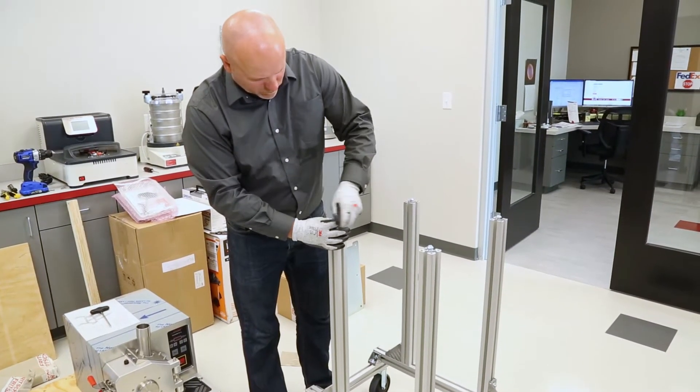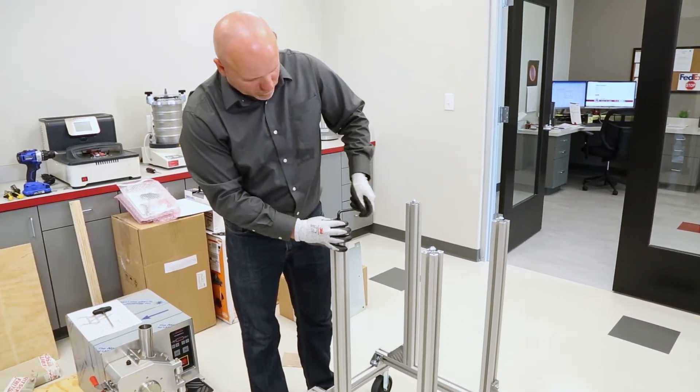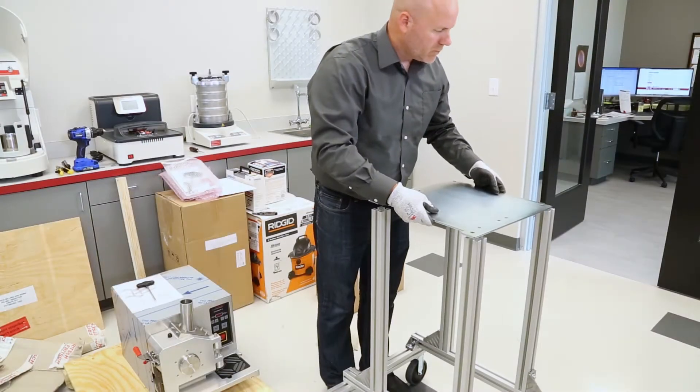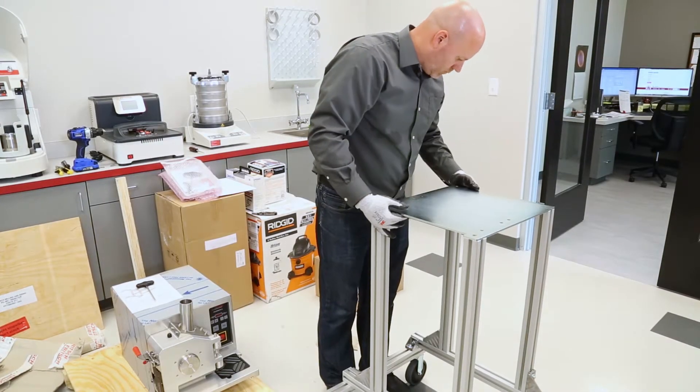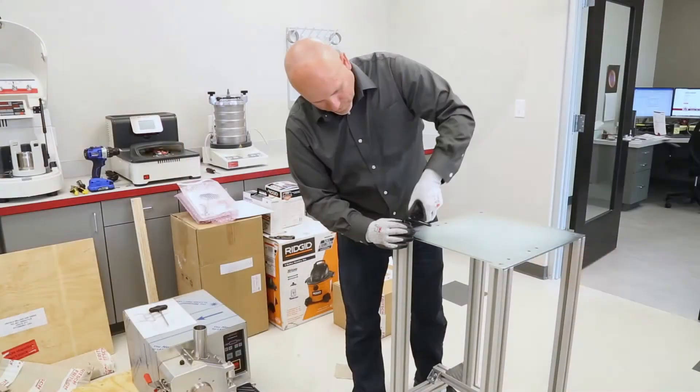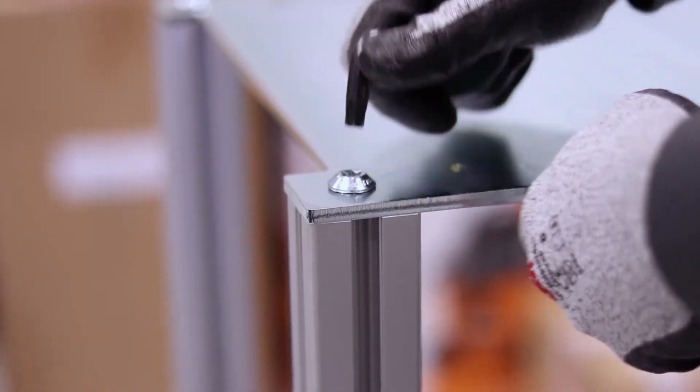Remove the screws from the top of the aluminum legs. Place the top plate of the P19 stand on top of the legs and fasten with the screws. The top plate should be mounted with the U-shaped cutout facing front to align with the U-shape in the stand itself.